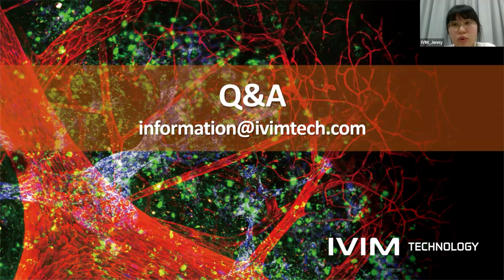And another example would be the liver imaging window, which also, after taking care of inflammation after surgery, can last from a couple of weeks to maybe a month or two.